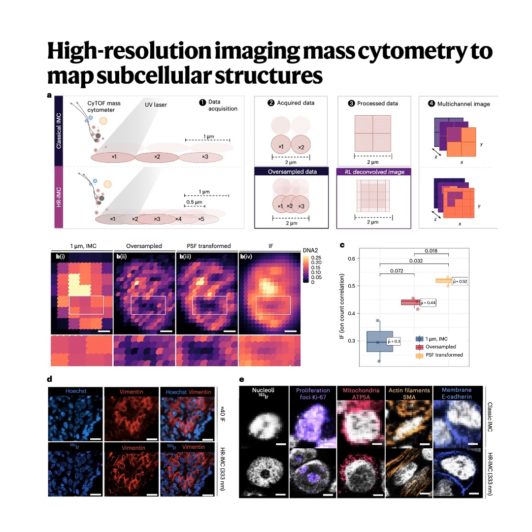And they confirmed this accuracy against H&E staining, the histological ground truth, and found HR-IMC accurately separated individual cells where the classical method failed. This practical application alone is transformative for immune-oncology studies. So to recap, HR-IMC is validated against light microscopy. It reveals these submicrometer structures, and this high resolution translates directly into accurately counting individual immune cells in dense tissue.